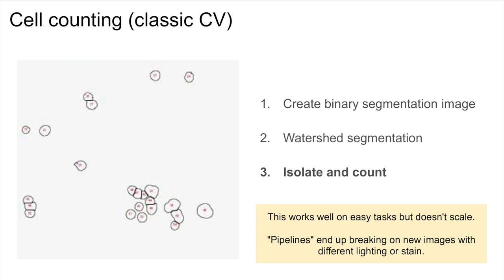This approach is straightforward and continues to be popular. However, they have issues when being applied to new images and need to be reconfigured to account for changes in light, cell size, magnification, and camera artifacts.